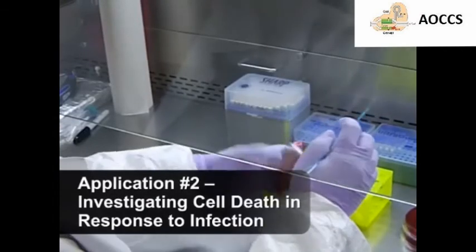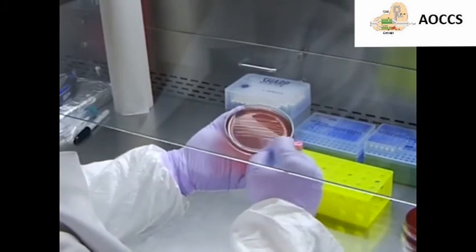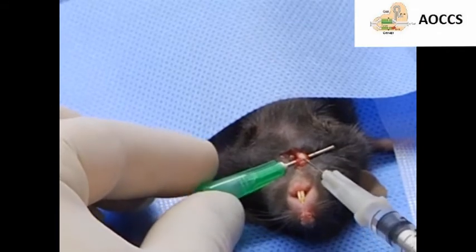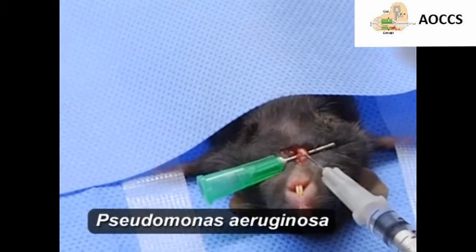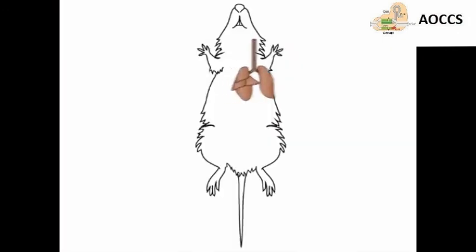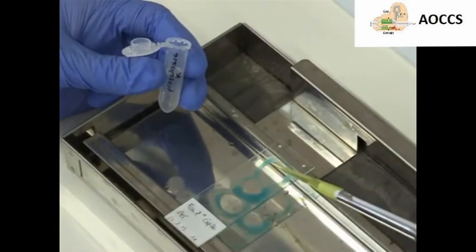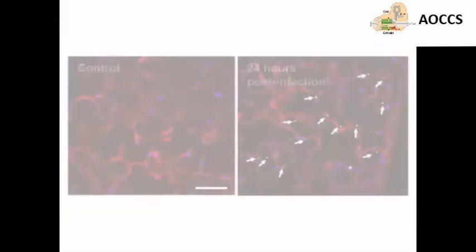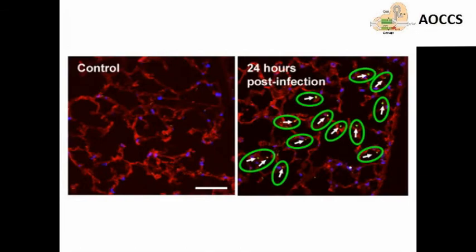Scientists also use the TUNEL assay to investigate apoptosis in response to bacterial infection. In this experiment, scientists developed a model of pneumonia by injecting mice with Pseudomonas aeruginosa, which induces lung inflammation. Then lung tissue was removed and TUNEL staining was performed to examine apoptosis in response to the bacterial infection. Results show that apoptotic cell death increased in mice exposed to the bacteria as compared to control animals.